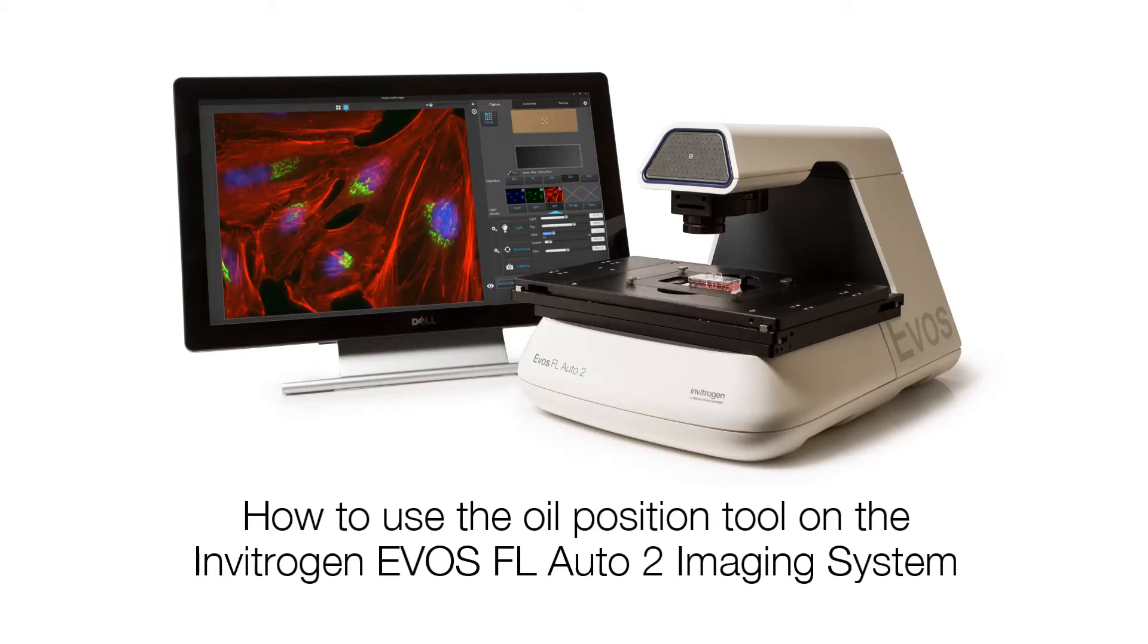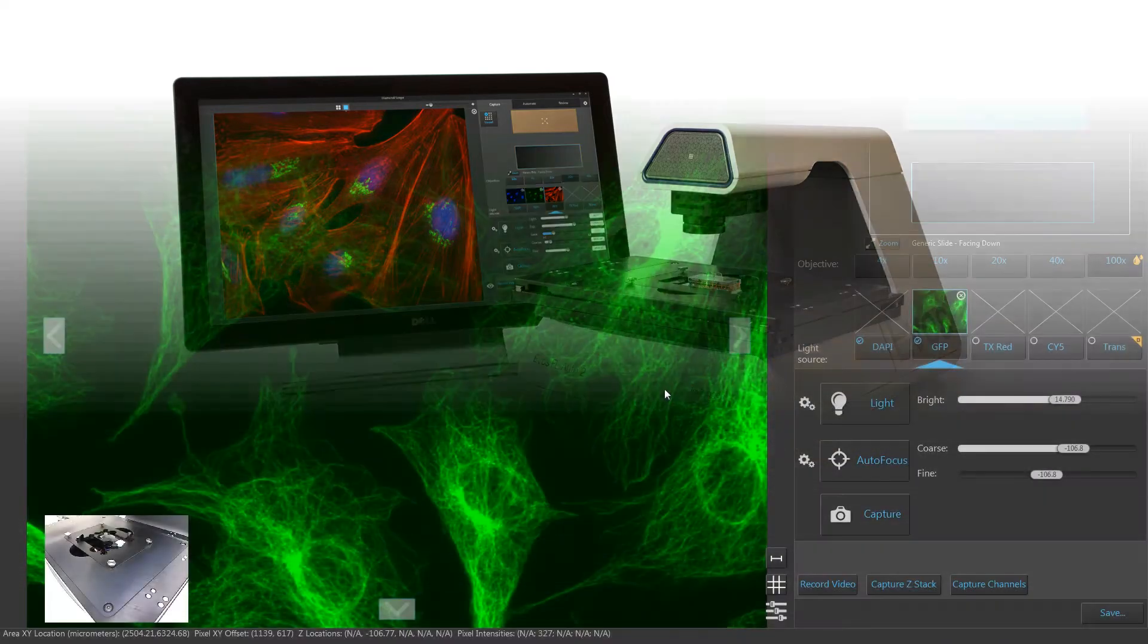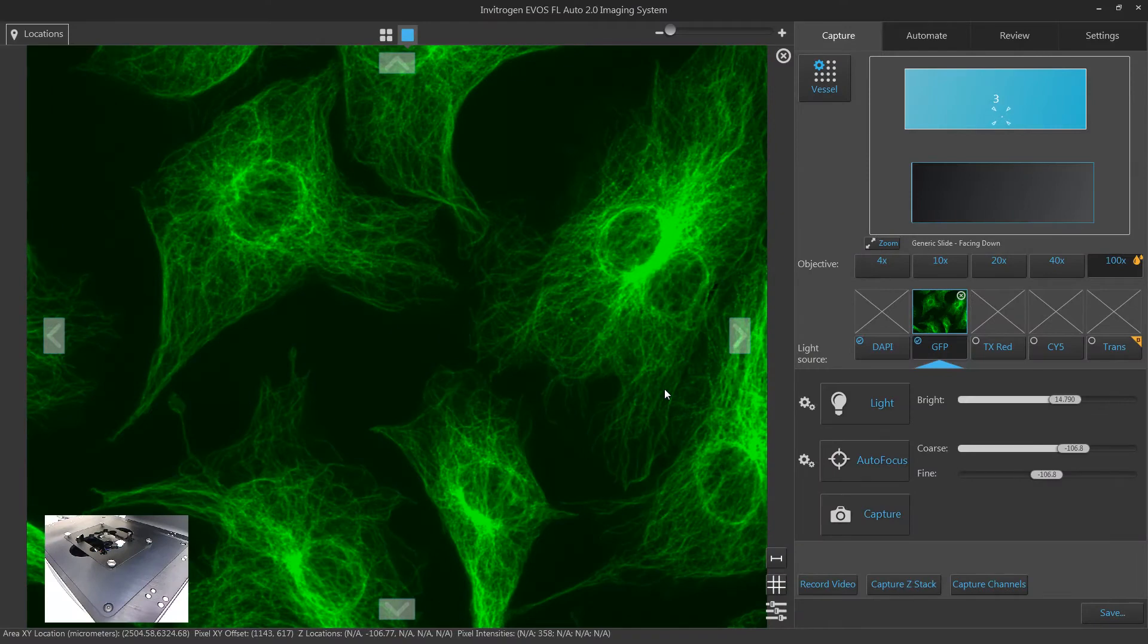In this video, you will learn how to use the oil position tool to add oil onto your oil objectives without having to remove your sample.